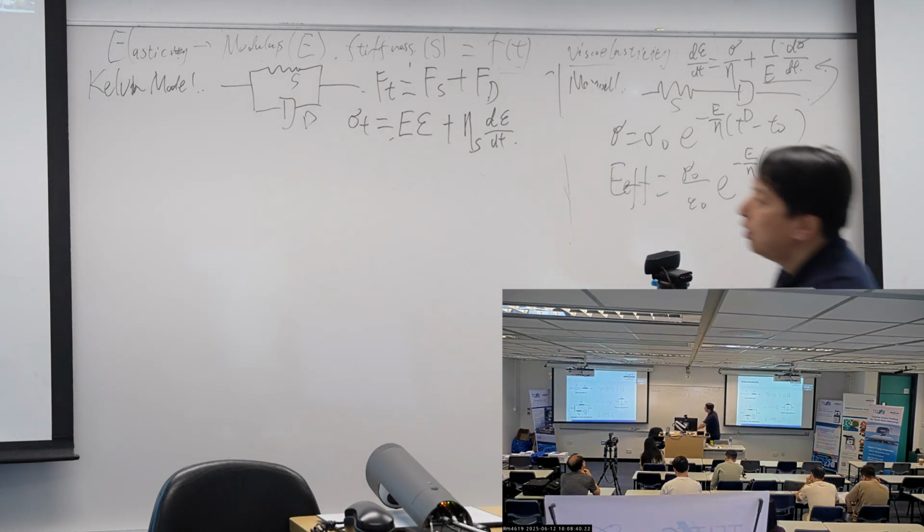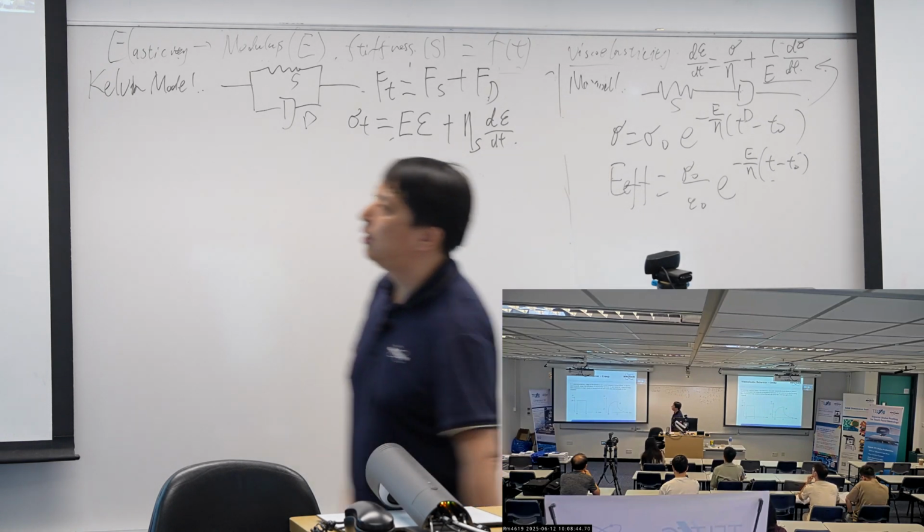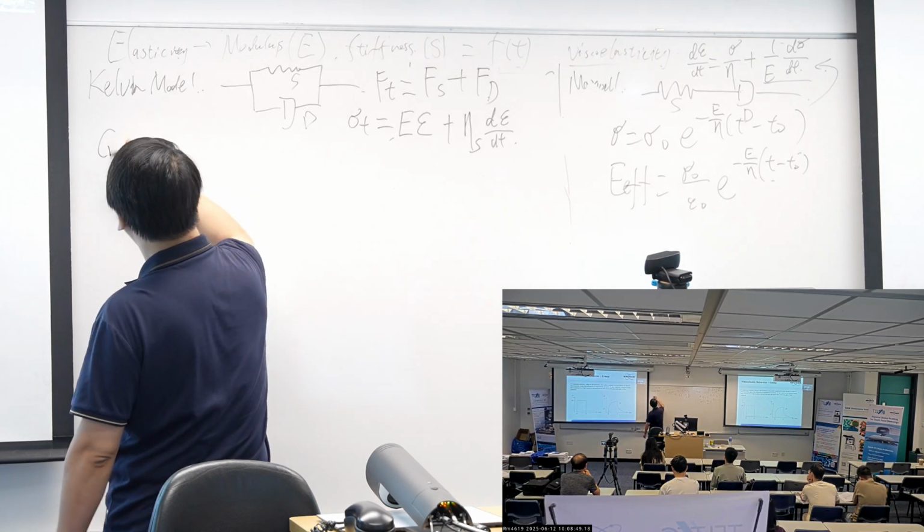And this model, Kelvin, describes the creep movement.